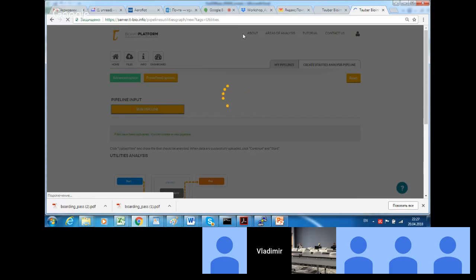It may take up to several seconds or even half a minute to start. Generally it's a simple task, and the speed here can be increased.